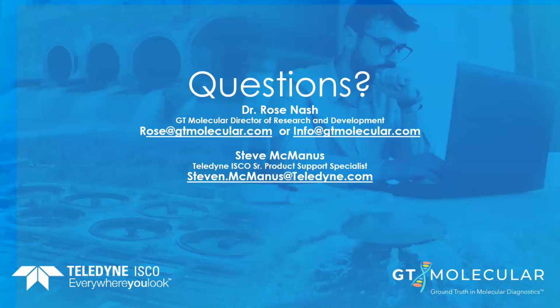I think the answer that was just given on the previous question kind of covers that, in that the COVID-19 residual that is in wastewater is effectively dormant and no longer active. So the risk of becoming infected with COVID when working with wastewater is at this point in time believed to be non-existent. However, as Dr. Nash indicated, there is a variety of other constituents in that wastewater sample that should remain of concern and would bear out the continued need to be very cautious in the approach so that one is able to prevent any direct contact with those samples being collected.